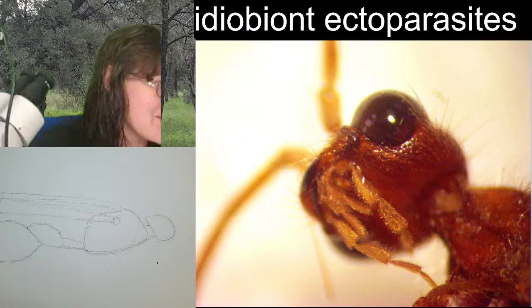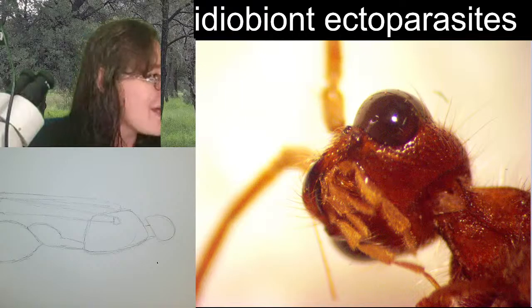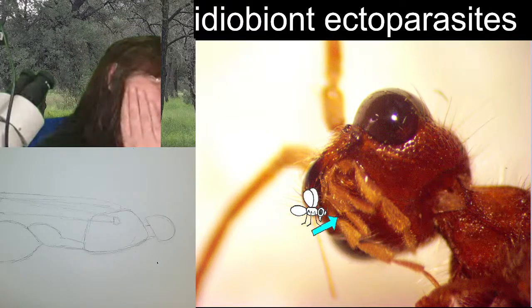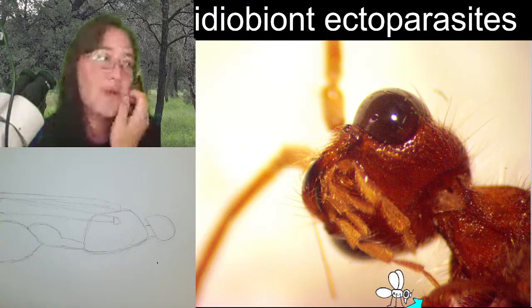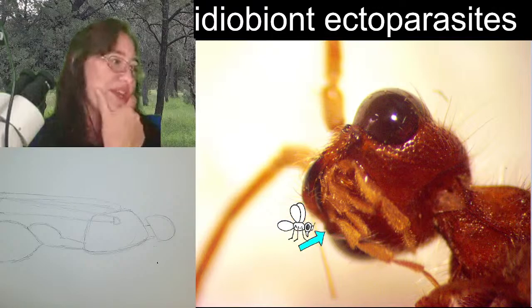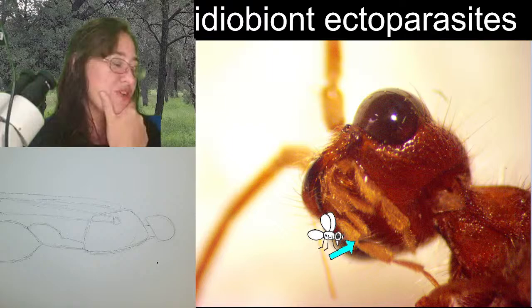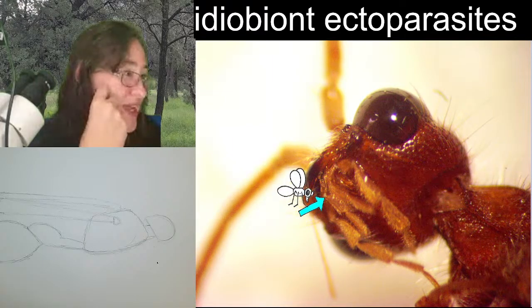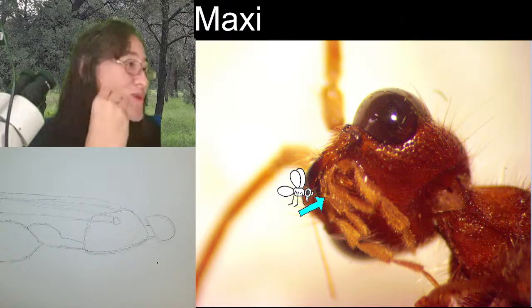There seem to be too many segments in here. But if we look right around here and here, there should be four palps that we are looking at. So I think that there's one here and here. Those two long ones are likely maxillary palps. And it looks like right here and here, there are two kind of shorter ones, and those would be labial palps.